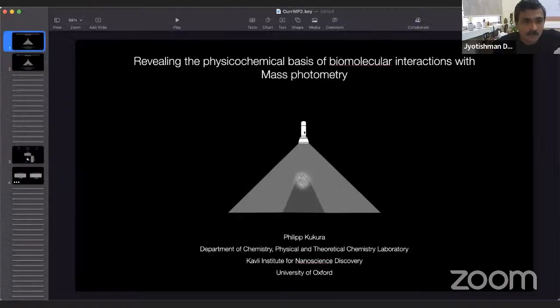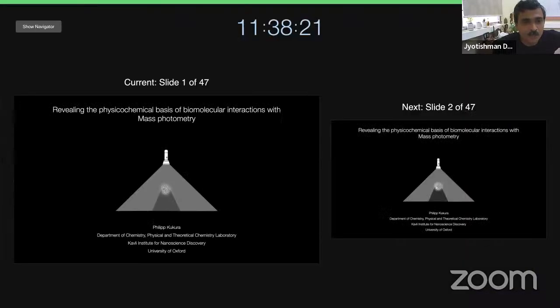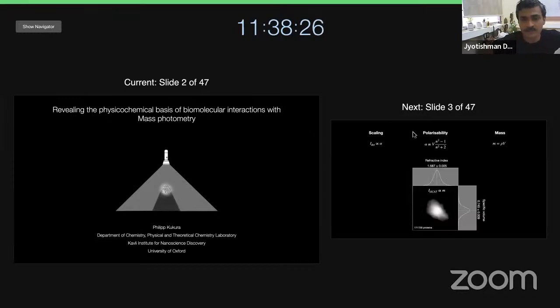Yeah, of course. This is from Arindam Ghosh. Great to hear about your science, always, Phil. Could one do intensity-based correlation with iSCAT using a prominent scattering probe, like its fluorescence counterpart in FCS?